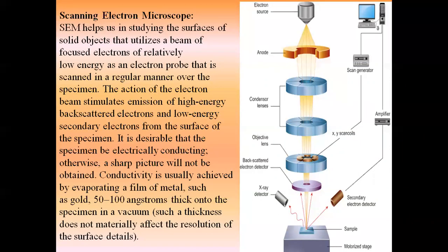Whereas in the scanning electron microscope, in comparison to TEM, it is a low voltage, about 1 to 30 kilovolt. So that is the voltage difference.